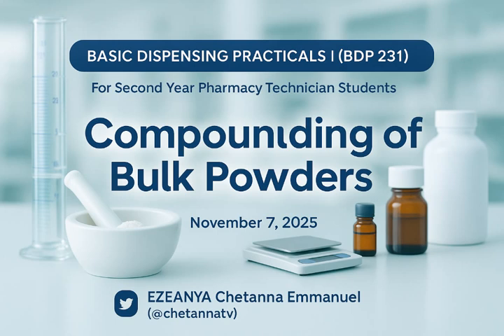Then we also think of, apart from the ingredient waste, we also consider getting what you need. That's why I struck it halfway like this. Is that clear? So if you decide to use 0.07, no issues. But I assume that using 0.1 is like doubling everything. It will be much. Am I communicating? Yes. So the most important thing in the overage is that your overage should be what? Proportional. So there will be no mistake in your work.